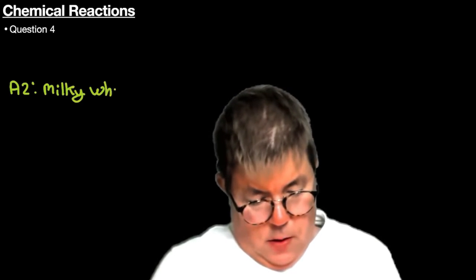Okay, next. In the next question, they're going to ask us about precipitation. So, for example, if in A2 again we see a precipitate, we'd write A2 and we'd say milky white solid. Make sense?